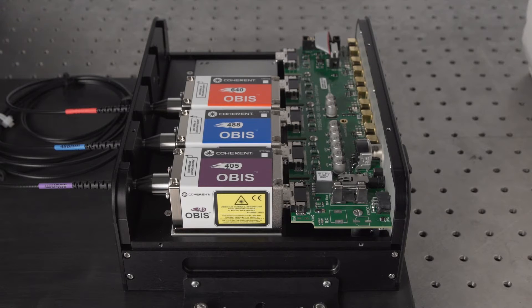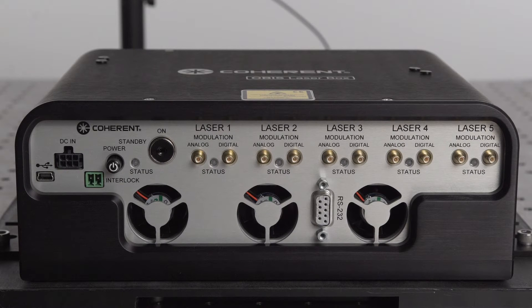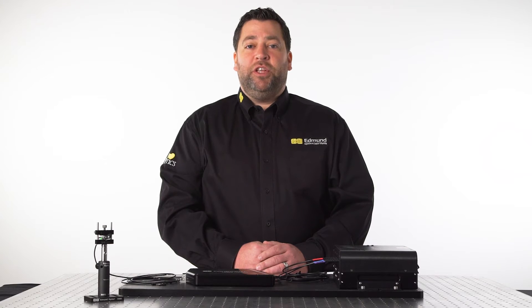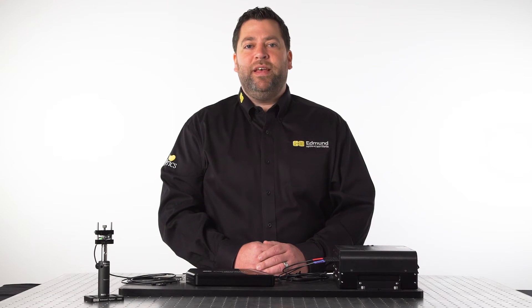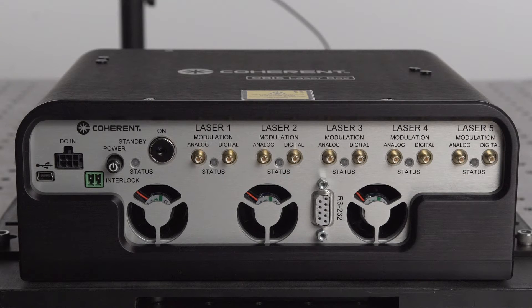The laser box acts as power supply, controller, and heatsink for up to five OBIS lasers. This convenient system houses the lasers and only requires one power supply to power up to five OBIS lasers. It also features a USB interface to connect to the user's computer to control the system via the provided Coherent Connection software. Access to each of the lasers' digital or analog modulation interface is located at the rear of the laser box.